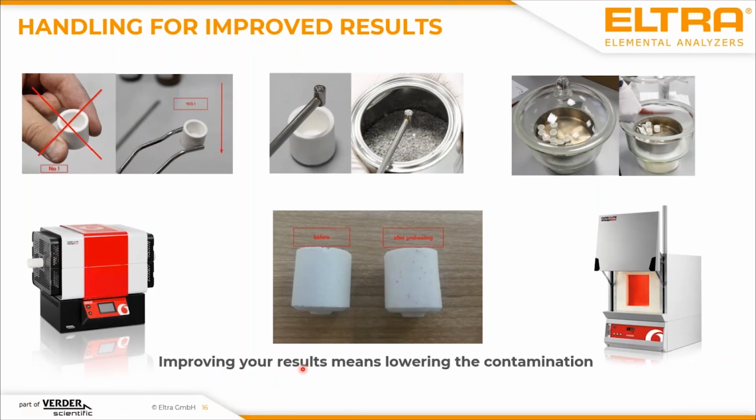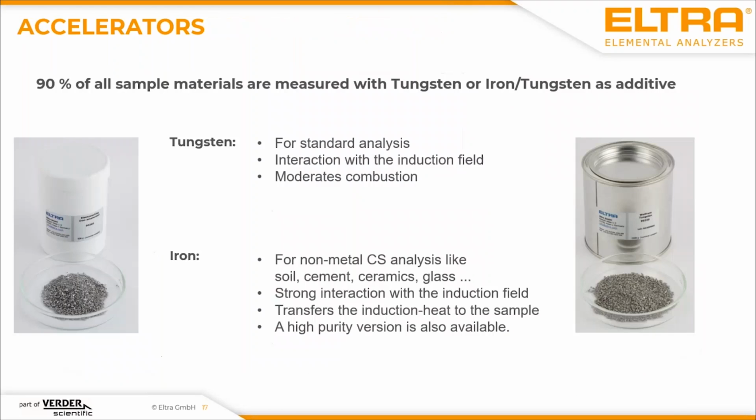This will improve your results because you lower the contamination, and it will save your fingers from burning them. Then we have the accelerators.